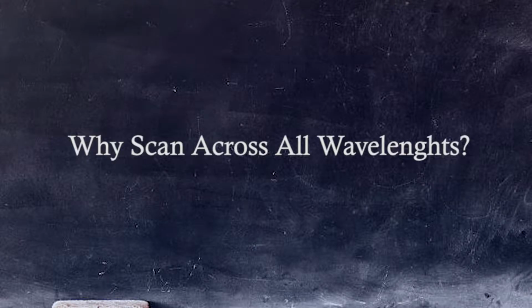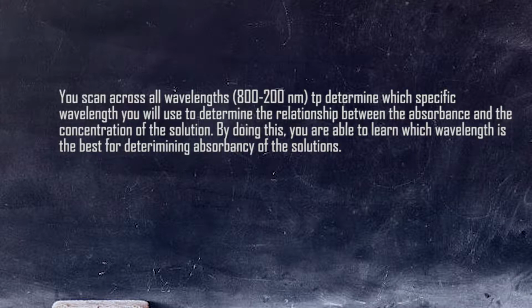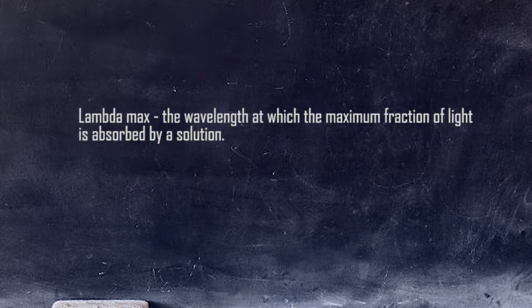Why scan across all wavelengths? You scan across all wavelengths to determine which specific wavelength you will use to determine the relationship between the absorbance and concentration of the solution. By doing this, you are able to learn which wavelength is the best for determining absorbency of the solution.